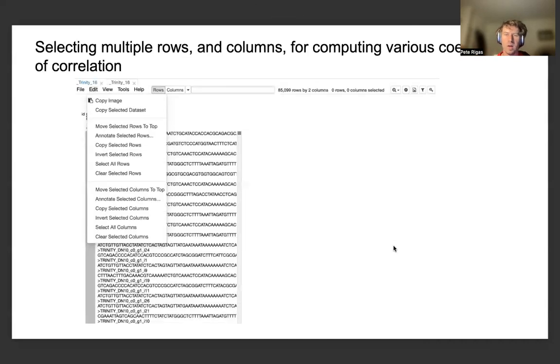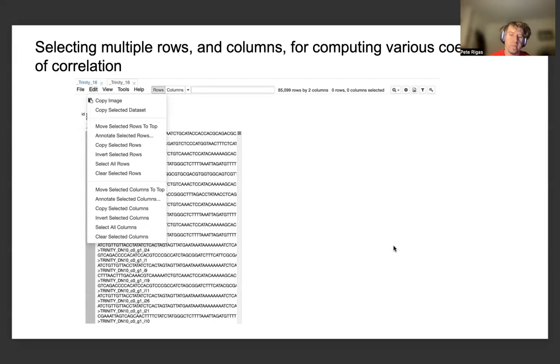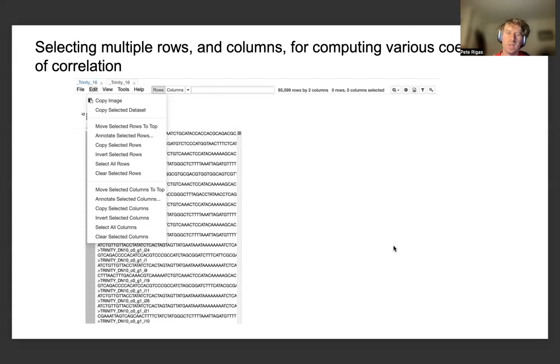We can also select multiple rows and columns for computing various coefficients of correlation. For instance, given two genetic sequences, there can be many different types of metrics to assess how similar or different the two sequences are. A very simple metric to compare DNA sequences would be the Hamming distance, which measures the difference between any one of the base pairs across all base pairs of the sequence. But there can also be more sophisticated coefficients of correlation, which we can compute from either all sequences in the FASTA file or from a couple of isolated sequences.